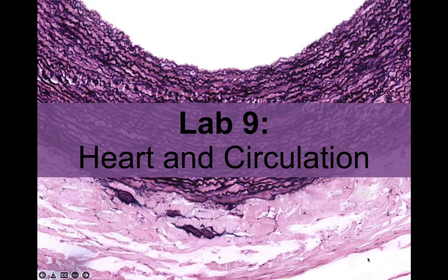Hello everyone, welcome to Lab 9. Today we are going to discuss the heart and circulation, which includes blood vessels and lymphatic vessels.